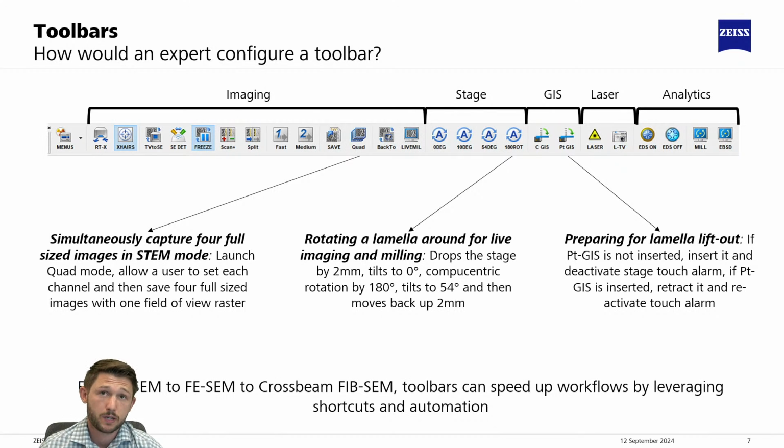So you saw in all those videos the use of these macros and automation and shortcuts in the toolbar. The toolbar is something that is uniquely tied to different user accounts. So we saw already a little bit of the novice toolbar where there's a wizard for getting the first image and for saving the first image and exchanging. A question that often comes up is, what are some of the imaginative limits? What can an expert do with configuring a toolbar?